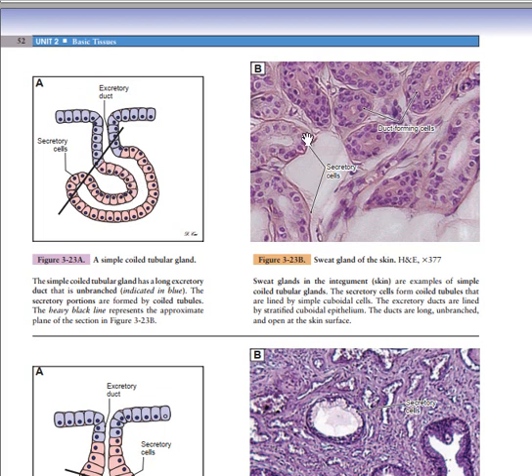You see here that the cell is a bit coiled, because the section has been cut transversely in this direction. This is why the coil is not easily seen, but you see the loop is actually slightly coiled like that. This loop is slightly coiled. This loop is also slightly coiled. Here is the lumen, and here are the secretory cells close like that. Also here is slightly coiled. Here is the lumen, and here are the secretory cells.